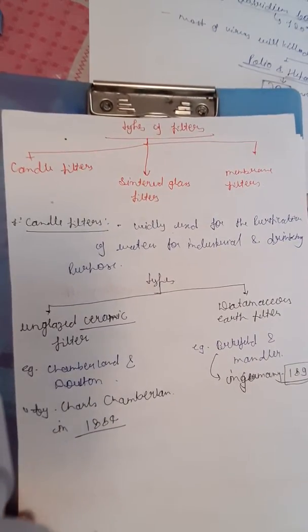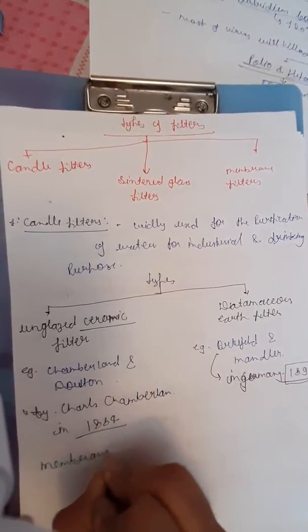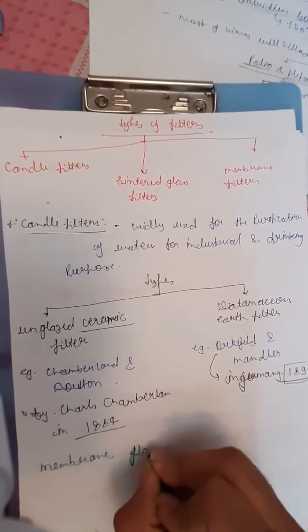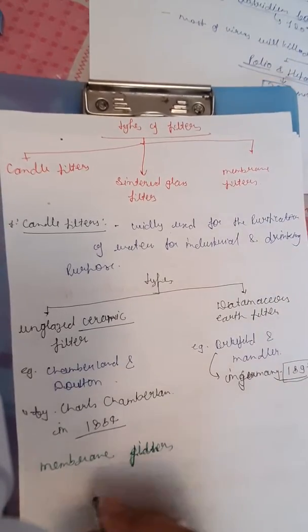And next we will discuss membrane filters.